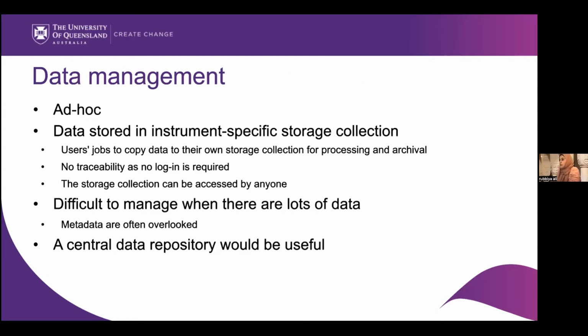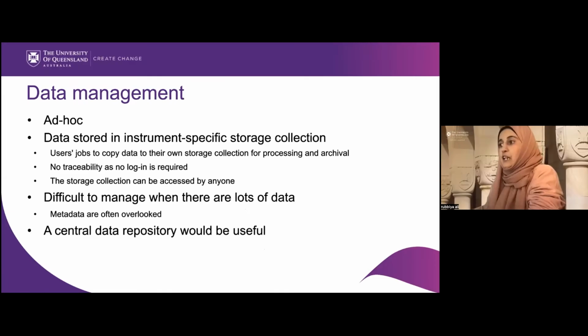To start with, I would like to explain the data management protocols we had at CMM before Pitschi. Before Pitschi, we were managing all the data on an ad hoc basis. That means we didn't have any common standards, so each building was managing data very differently.